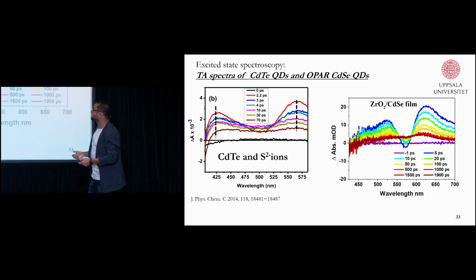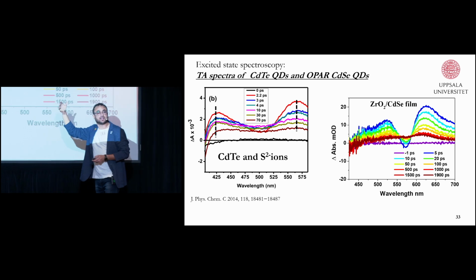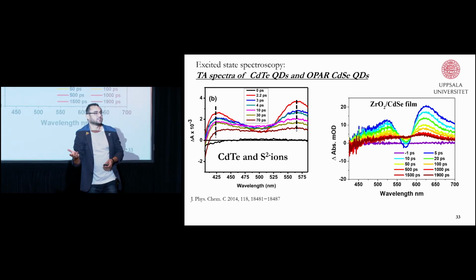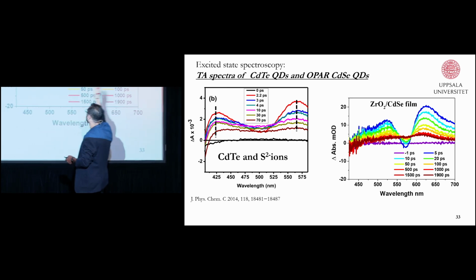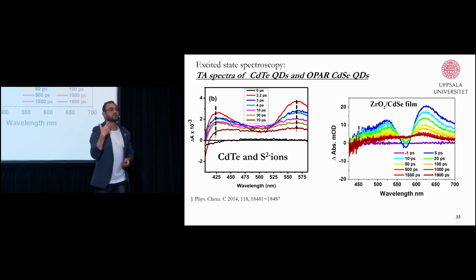We figured out that this spectroscopy looks very weird compared to what I get for cadmium selenide, simply because she used a lot of sulfide as a capping agent. This extra sulfide takes the holes and forms what we call polysulfide radicals, which is a totally irreversible process. Once they form, they're still there. That's why they absorb in the entire range.